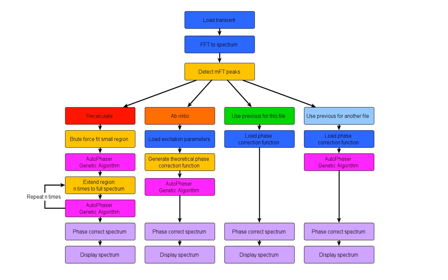Once you've successfully phase corrected a file to absorption mode, you can then save the phase correction function to a small file known as a phase correction function or PCF file, that will store the parameters of that phase correction function so you can reuse it. Autovectus will save this PCF file in either the same folder that the file exists in, or if it's a Bruker .d file, actually inside that file. There are then two different ways that Autovectus can reuse the information stored in these PCF files.